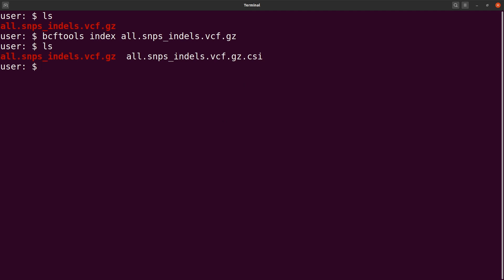Let's look at the second one, which is the TBI format. For that one we say bcftools index and we specify dash t, and then we specify the VCF file, and then we run it. That's how we do it.